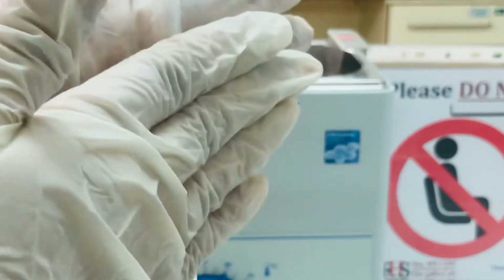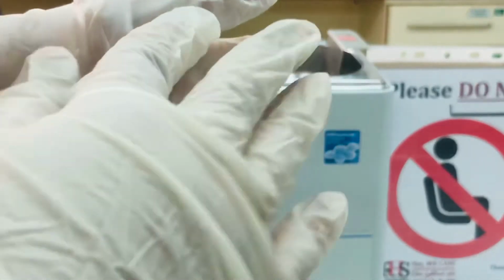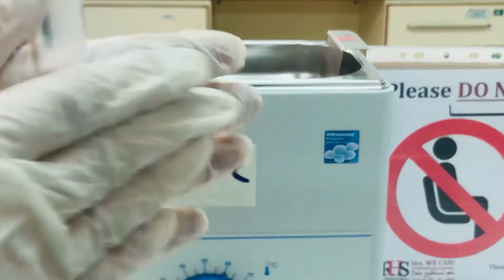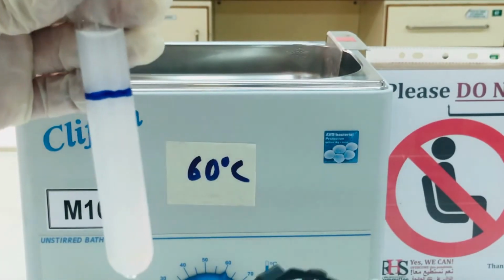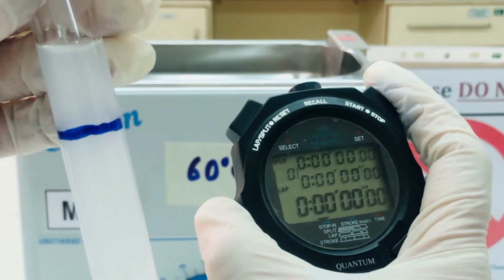We will swirl it a bit so that it is mixed. And as soon as it is mixed, we are going to start the stopwatch.